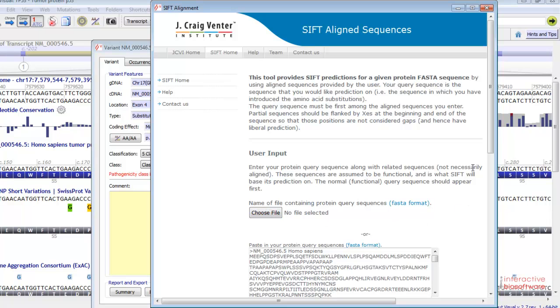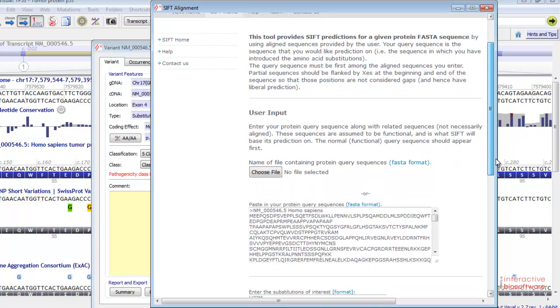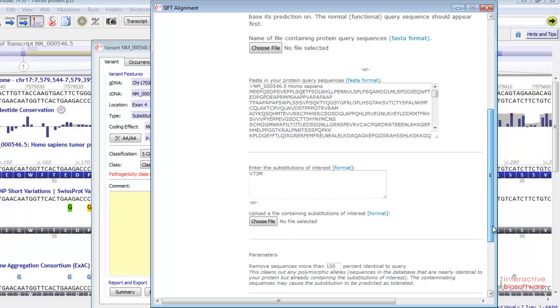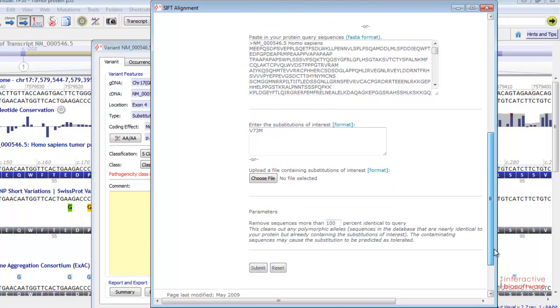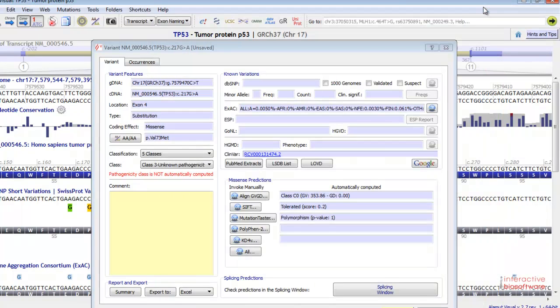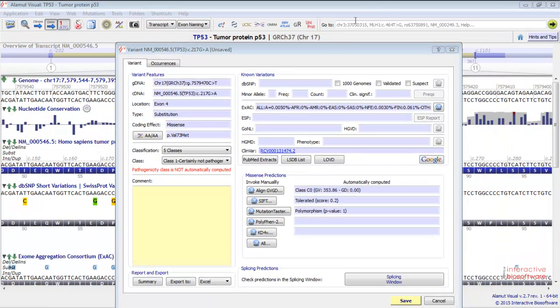The form is automatically filled in by Alamut Visual. You just have to submit the results.